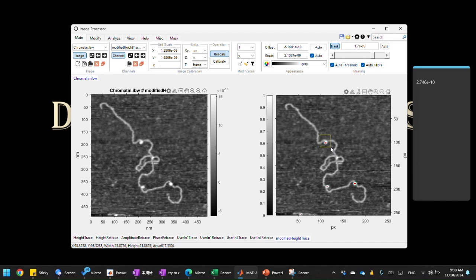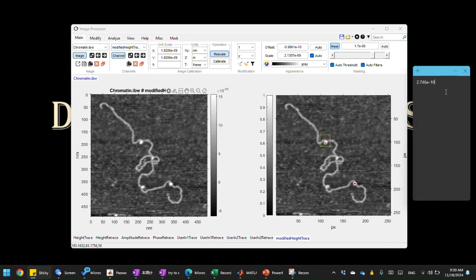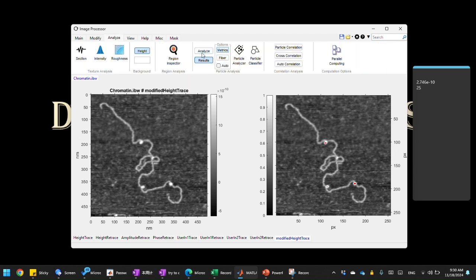Since the program only uses the size to create a square box, we use the same number for width and height. Right now, I think we can use 25 for our size of the box. Yes, let's use 25. Let's write down here 25 as our box size. Okay, so after that is taken care of, we then can analyze the proteins. Click Analyze here.